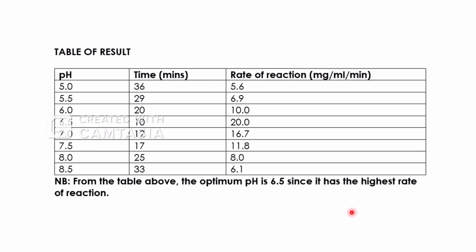So this is just a table to show the pH values that we have, the pH for each buffer, the time it took for a complete reaction, and the calculated rate of reaction in milligrams per mil per minute.